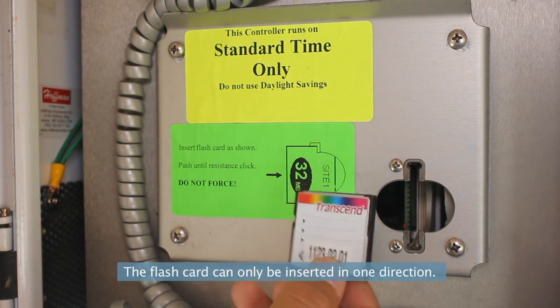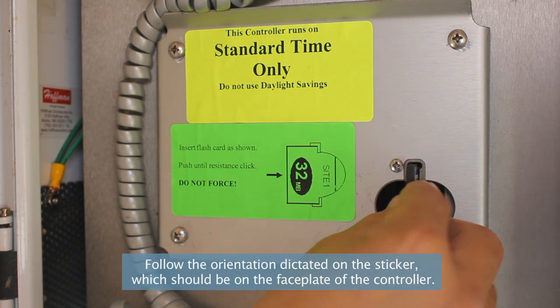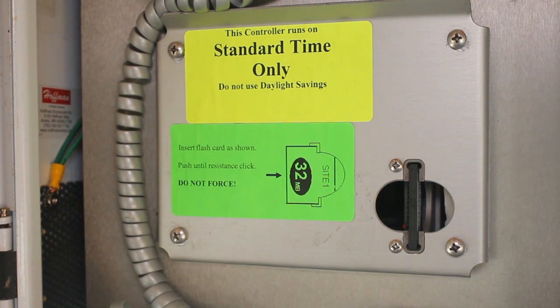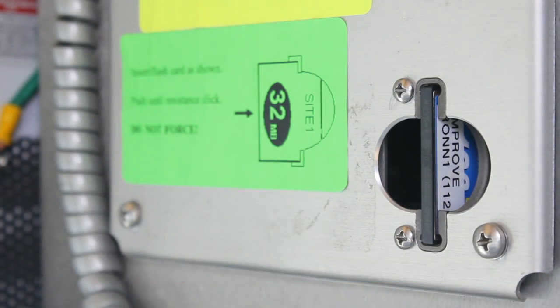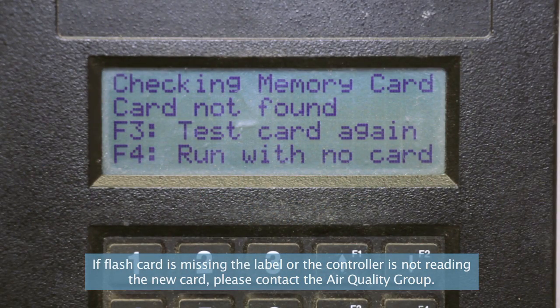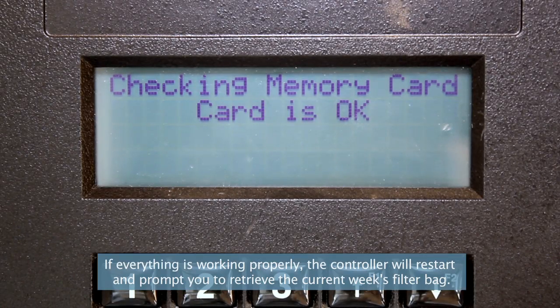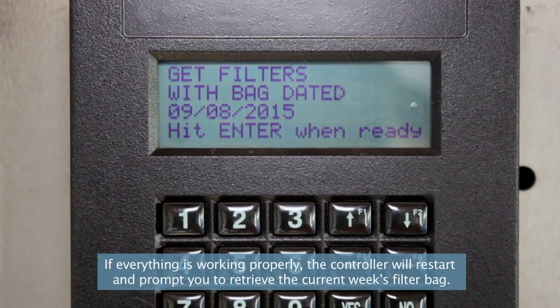The flashcard can only be inserted in one direction. Follow the orientation dictated on the sticker, which should be on the faceplate of the controller. Always insert the flashcard with the site code facing to the right. If the flashcard is missing the label or the controller is not reading the new card, please contact the air quality group. If everything is working properly, the controller will restart and prompt you to retrieve the current week's filter bag.